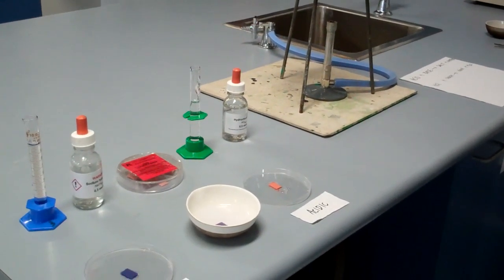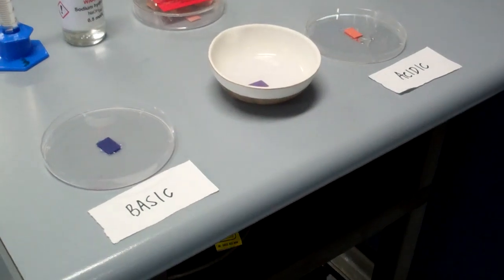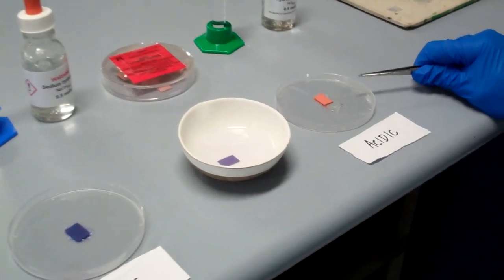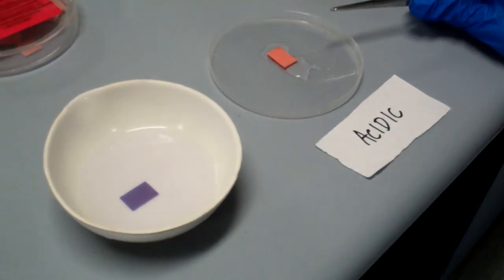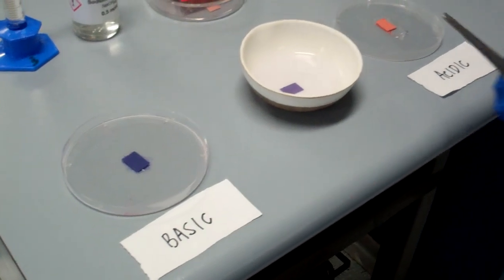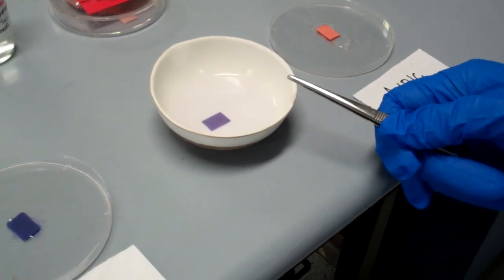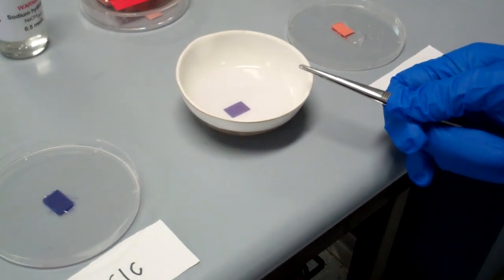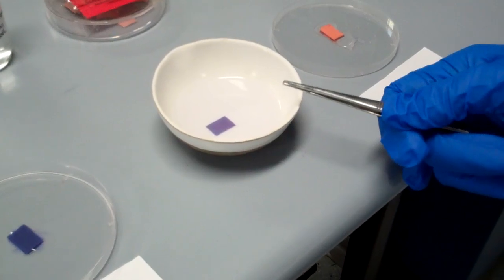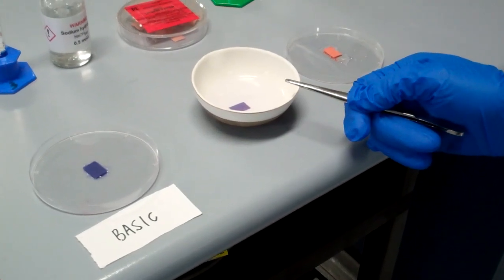So in this experiment we will be testing the reaction of acid with base, and it should give you a salt and water. So I have shown you the color change on the litmus paper. To begin with, acidic solution will give you a pink color on a litmus paper, and a basic solution will give you a dark blue color. For a neutral solution, you're meant to see a combination between these two colors, a violet, pinkish color on a litmus paper. So this is what you expect to see when you do your experiment.